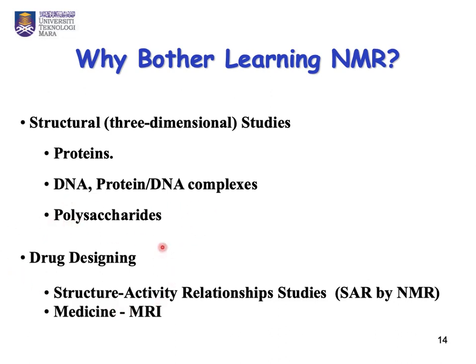It helps in the drug designing process also, in structure activity relationship studies, and then in the medical field, for brain imaging, which is called magnetic resonance imaging.